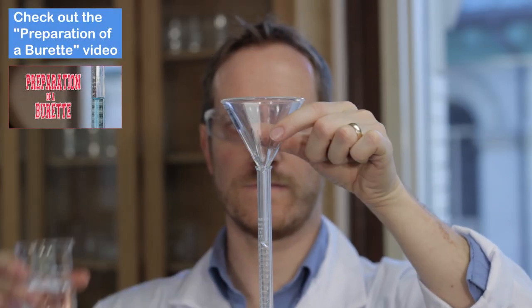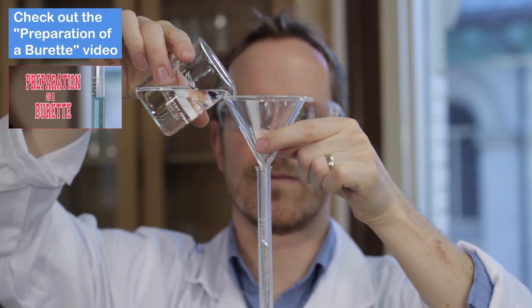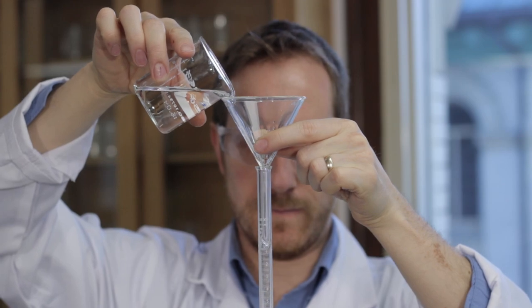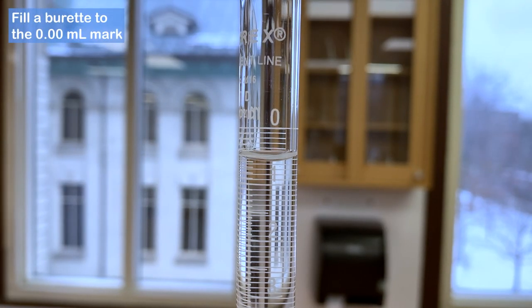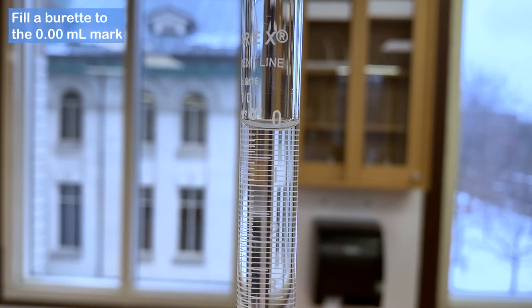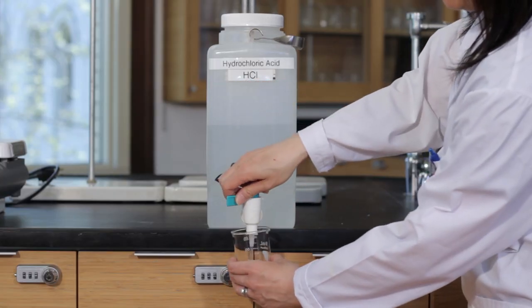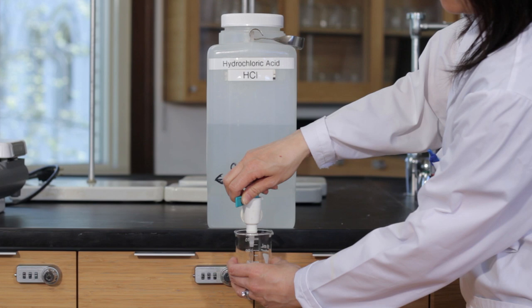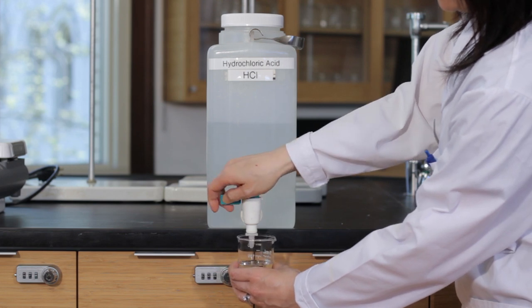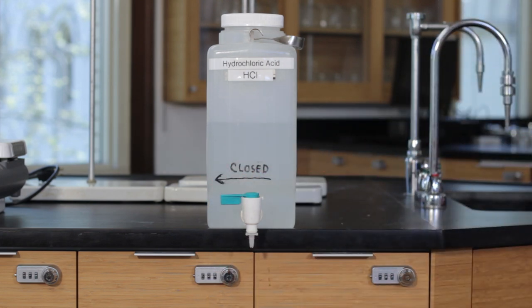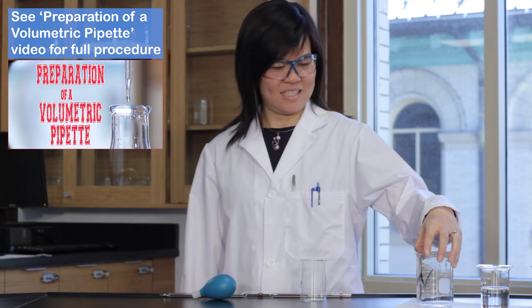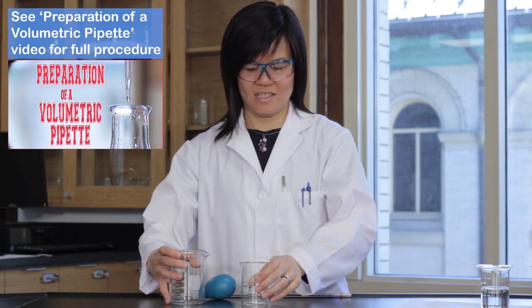Prepare the burette as demonstrated in another video. Transfer some of the hydrochloric acid from the main source into a clean, dry, medium-sized beaker. Prepare a 10 milliliter volumetric pipette as demonstrated in another video.